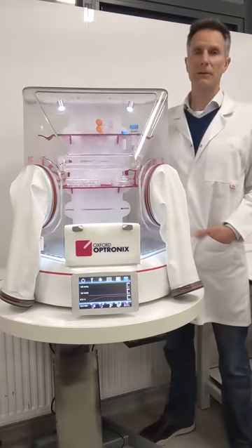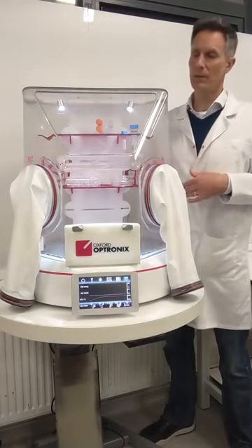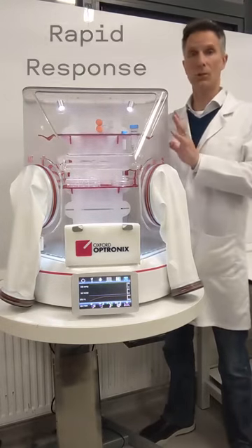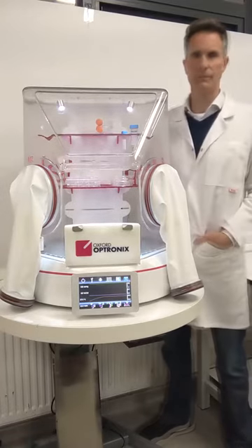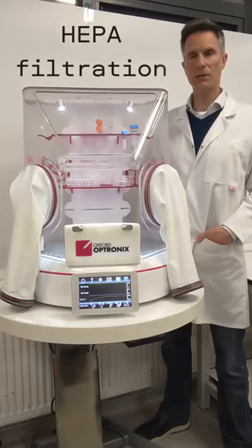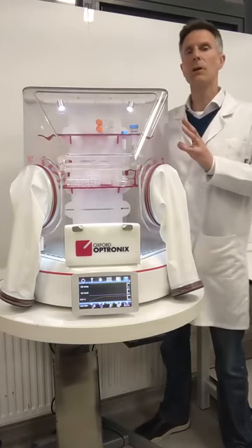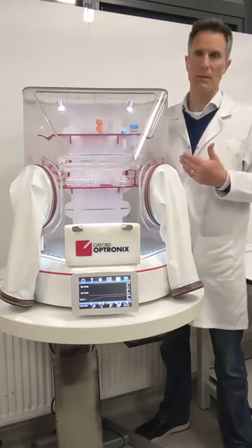A further benefit of the HypoxyLab that results from its compact size is the ability to change the internal oxygen environment in a relatively short space of time. In other words, the responsiveness of the system. We also use built-in HEPA filtration inside the HypoxyLab, which ensures that the internal environment is constantly being scrubbed through the HEPA filter to minimize the risk of contamination.